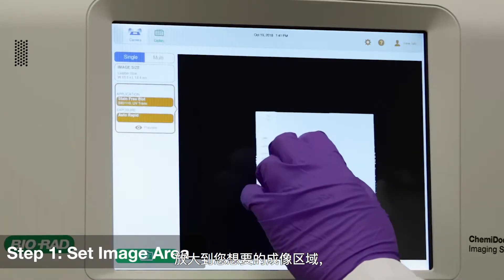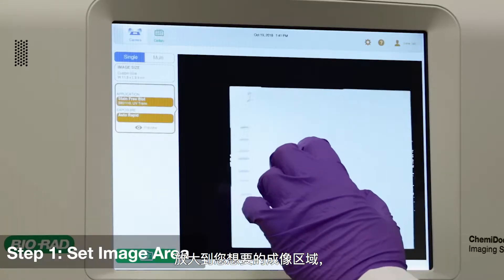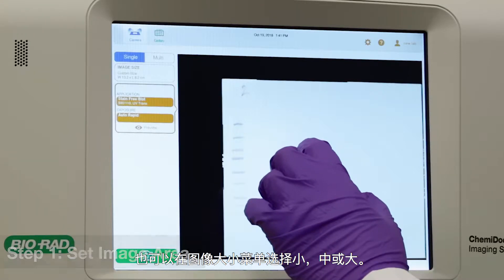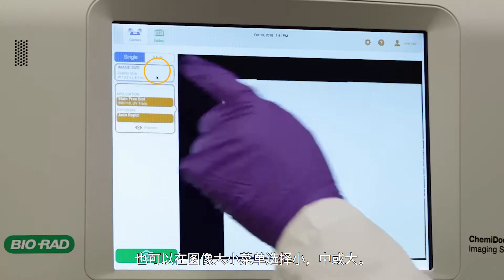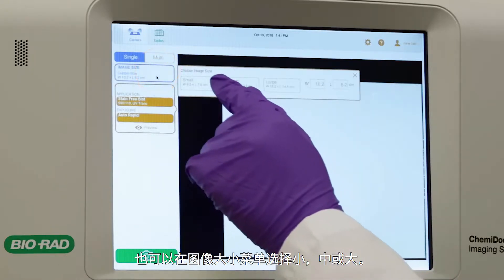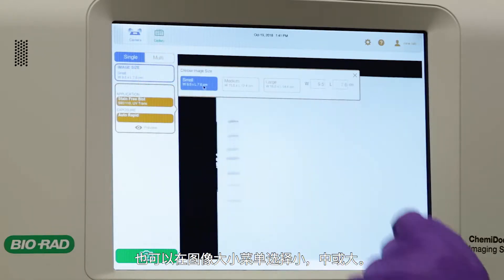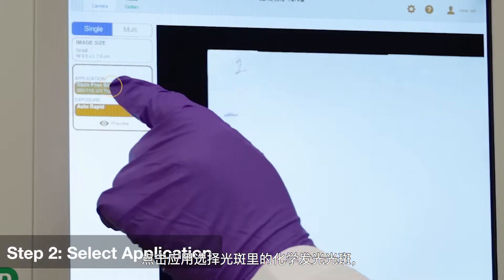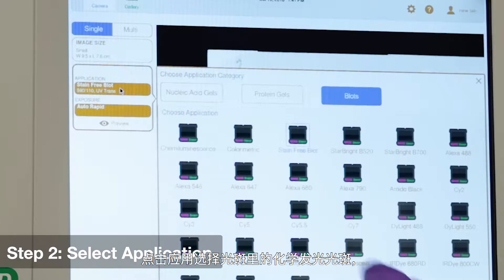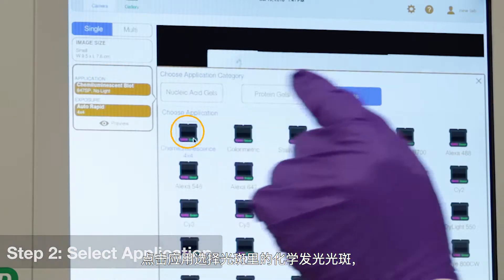Zoom in until you have the desired imaging area, or simply select small, medium, or large under image size. Tap Application and select Chemiluminescence under Blots.